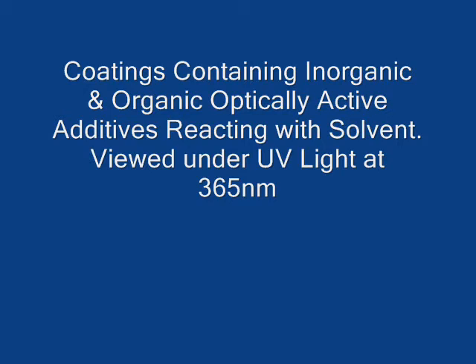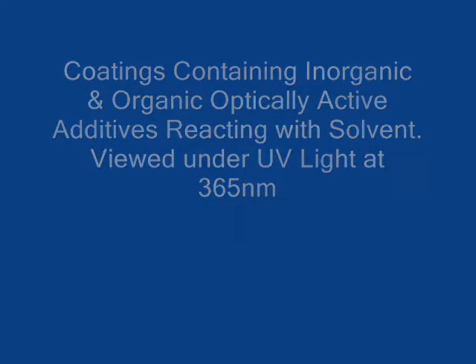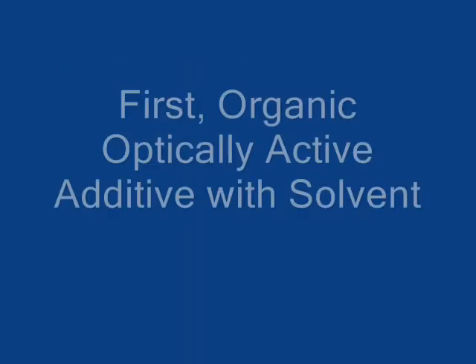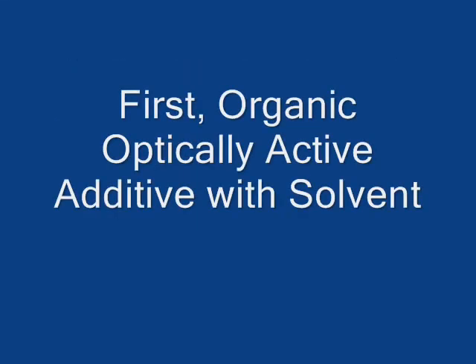Coatings containing inorganic and organic optically active additives reacting with solvent, viewed under UV light at 365 nanometers. First, we examine the organic optically active additive.